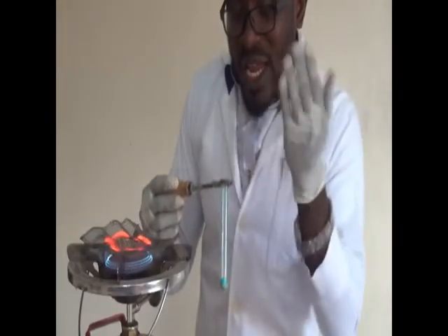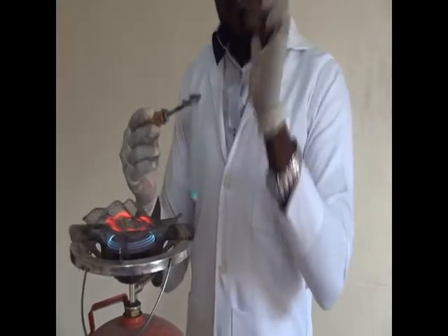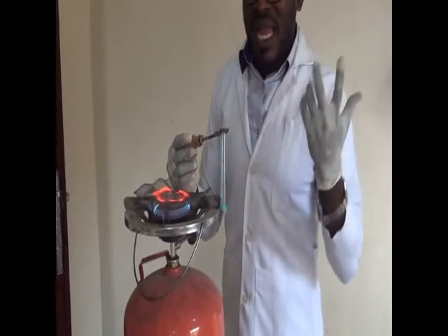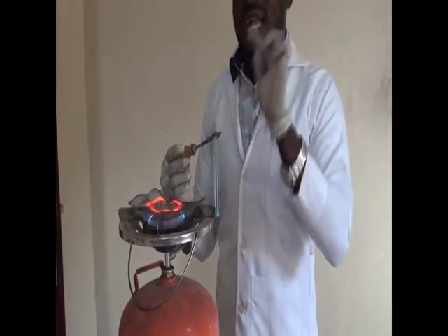Now this gas that is coming off, we will just do like this. You try to wave it. It does not have a choking smell. You wave it without getting your nose close to it. It does not have a choking smell, neither does it have an irritating smell. I cannot smell anything.